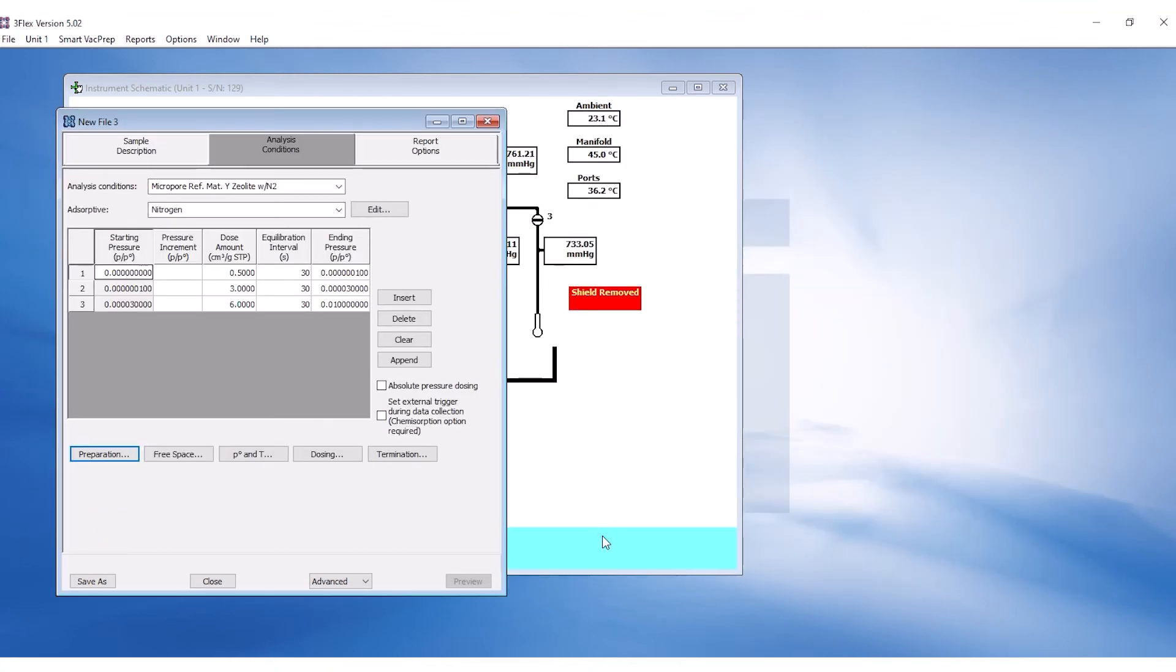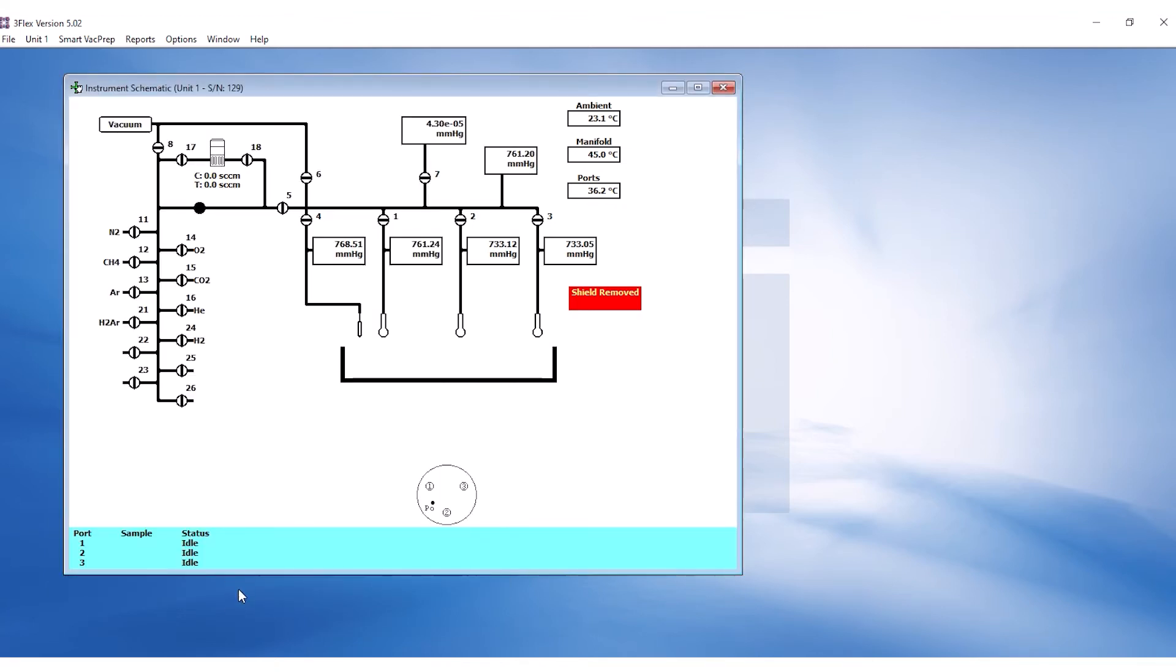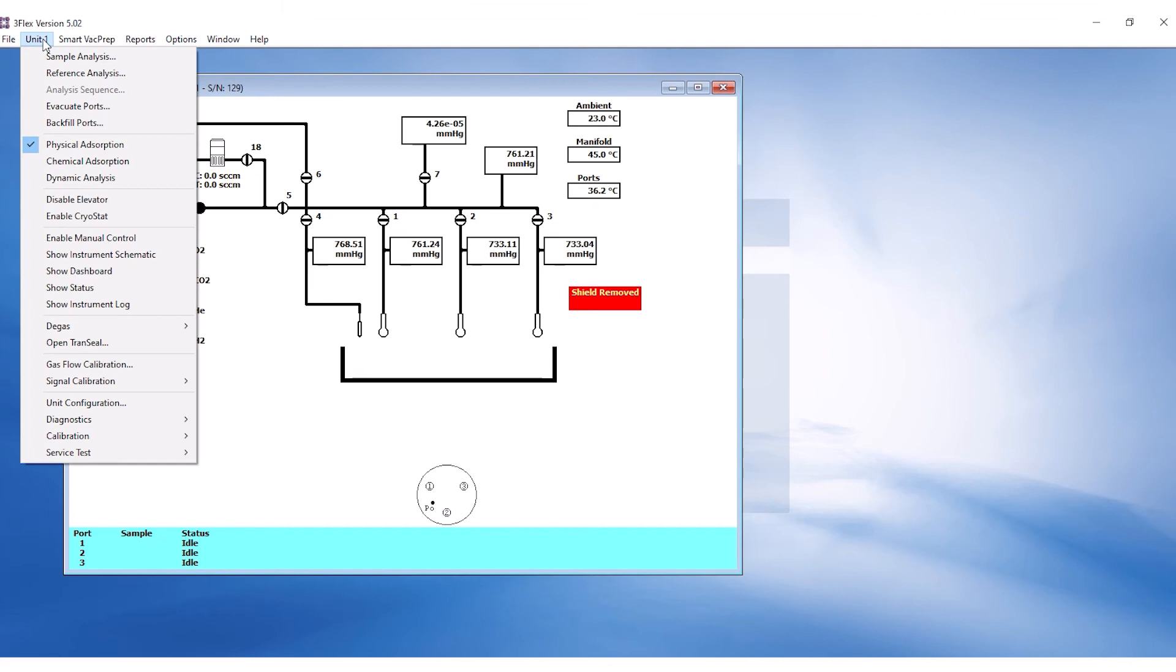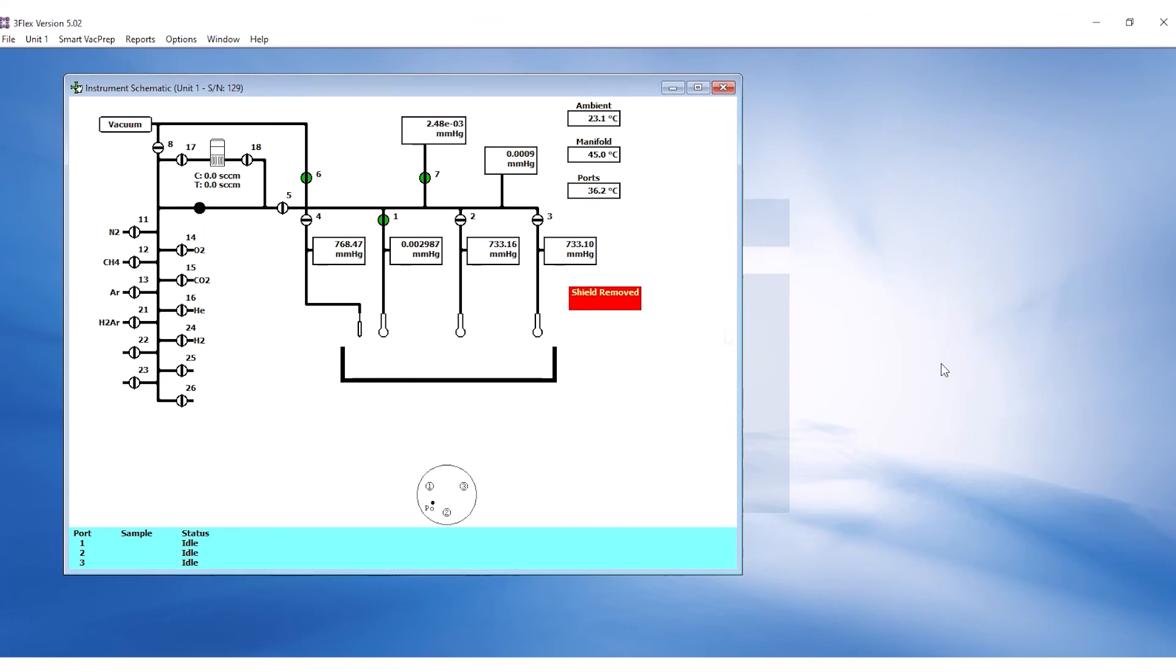Since Backfill is unchecked on the SMP file, the sample tube must be evacuated before analysis. Click on the unit menu and click Evacuate Ports. Select the port the sample tube is attached to and click Start. This will automatically backfill the manifold to match the pressure of the sample tube and slowly start to evacuate. Click Done once complete.